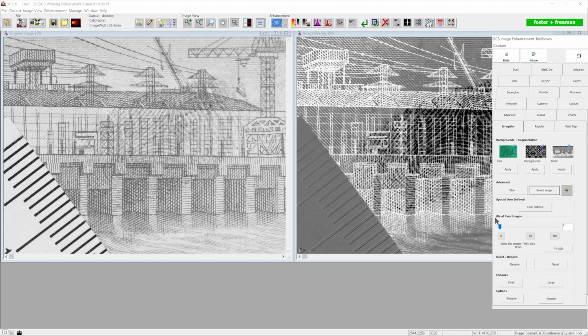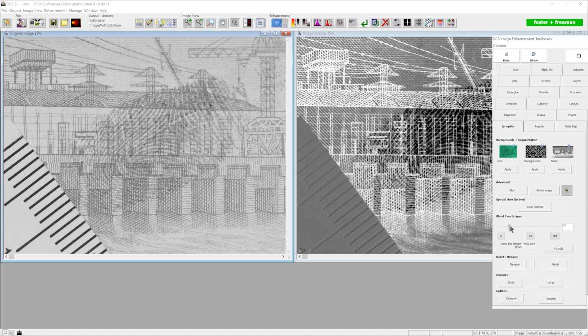We're going to look for our blue arrow, and we're just going to simply move this along the bar to adjust. We're going to see the adjustment in our original image. So this is the area of the screen we want to focus on. And what you'll see is as you move this bar along, you will start to see the image change.